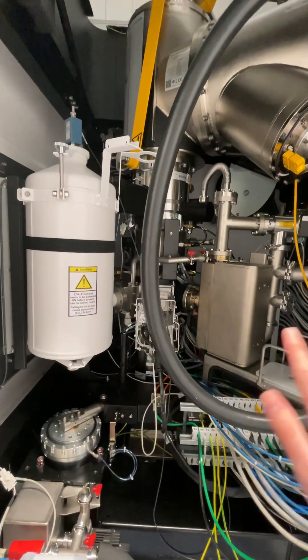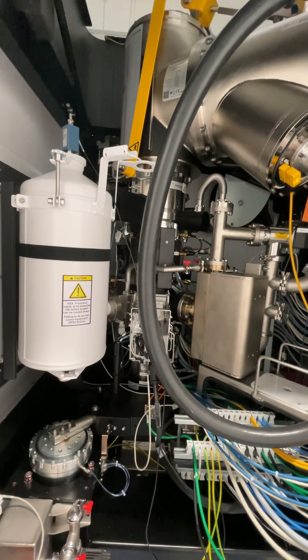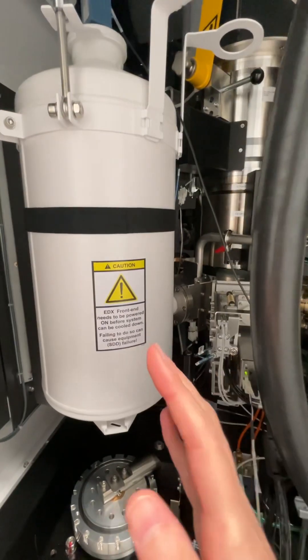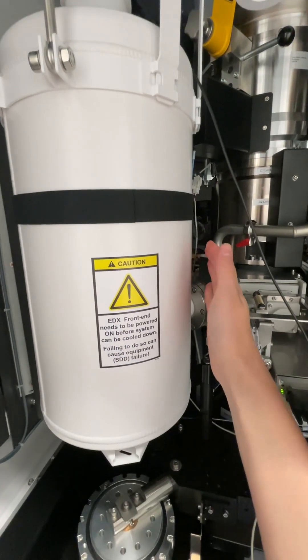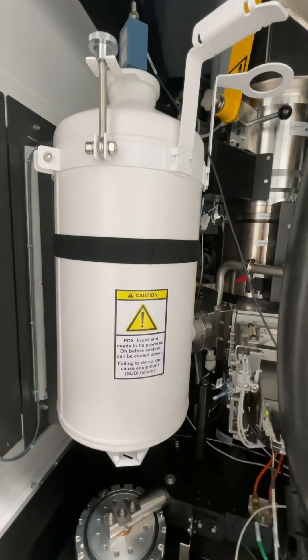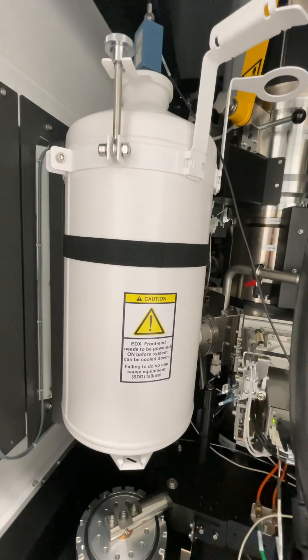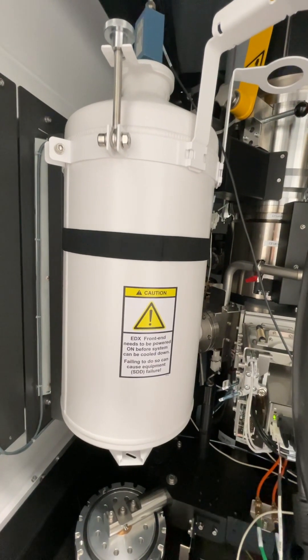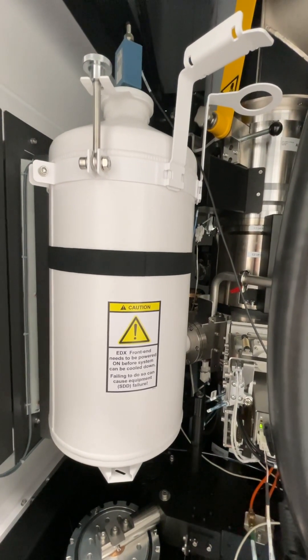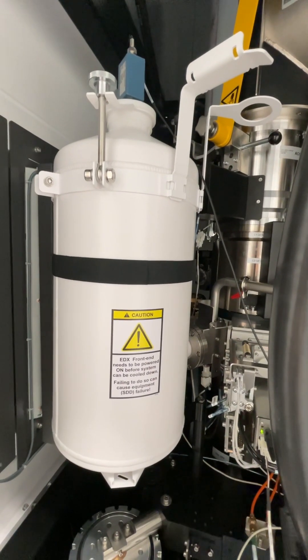This might look spacious because I'm using a wide-angle camera, but it's actually very confined. This is our liquid nitrogen dewar — I have my hand here for scale, so you can see it's very big. The lab manager, which is me, will fill this up once a week, and we run a cryocycle where we remove contamination that's built up in the column over the week and then start over again.